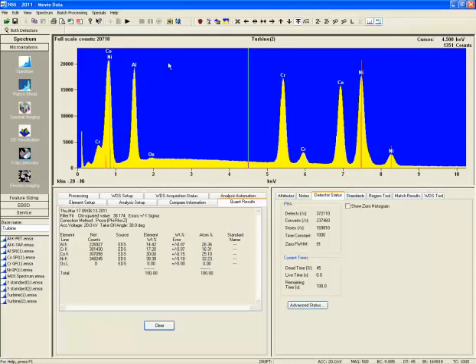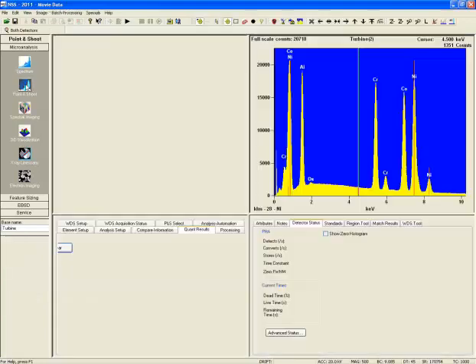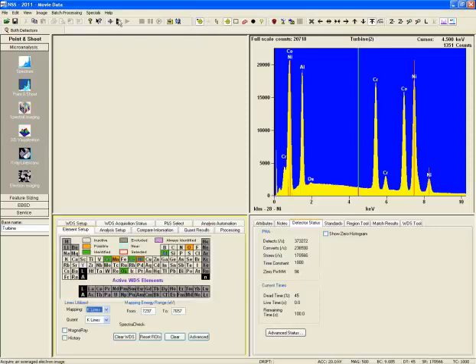The primary method of acquiring spectra on the sample is by the point and shoot method. So we will click on that mode button on the left-hand column, and it reconfigures the screen once again, and it permits us to grab an electron image with this gray button up in the toolbar, and it acquires the electron image as such.